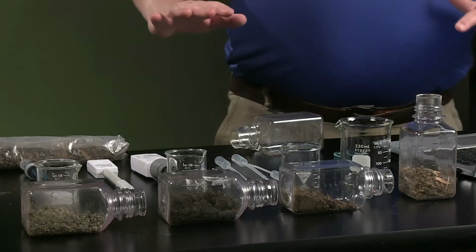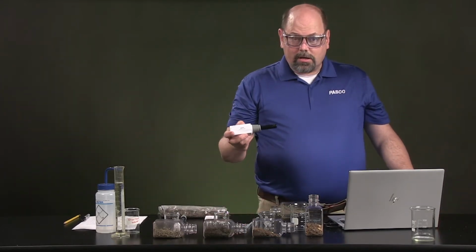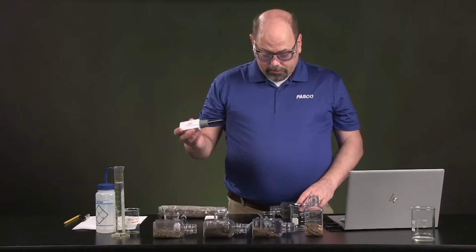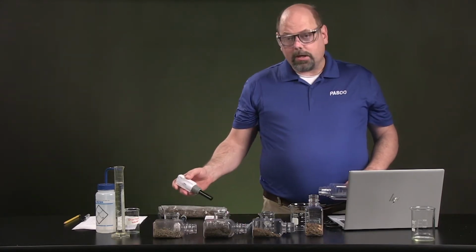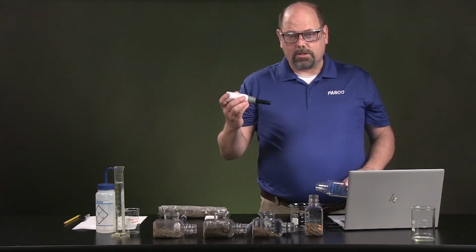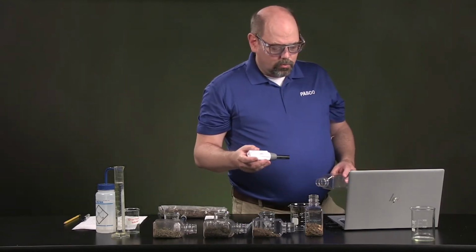Now that we've got the samples back in the lab, we want to make sure that our instruments are ready and set so that they're going to give you the best measurements. Each of these has got a calibration procedure, and I'm going to show you the CO2 process. You can always look these up in the manuals that come with the kits, or you can look on PASCO.com on the product pages, because in the documents sections the manuals are listed, and many of these have films as well that you can watch to see how the calibration should work.